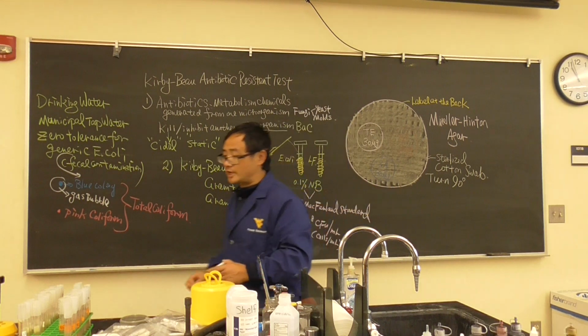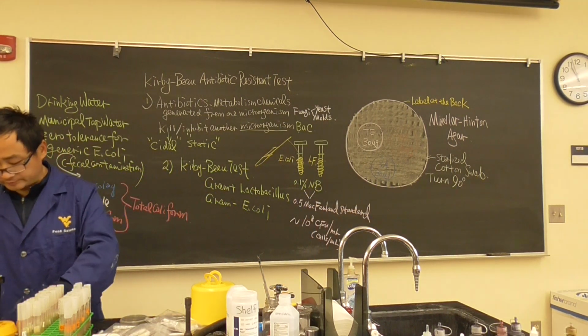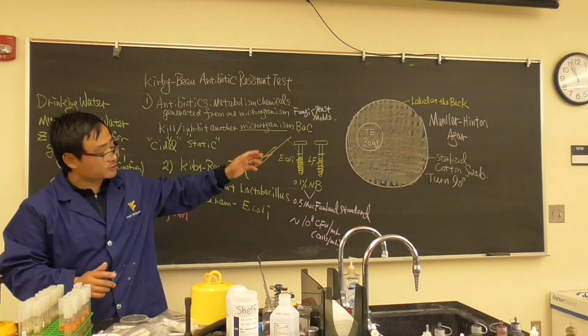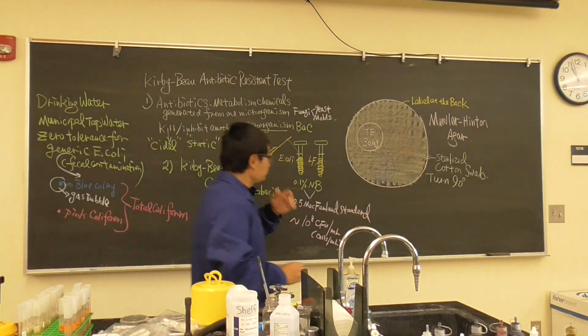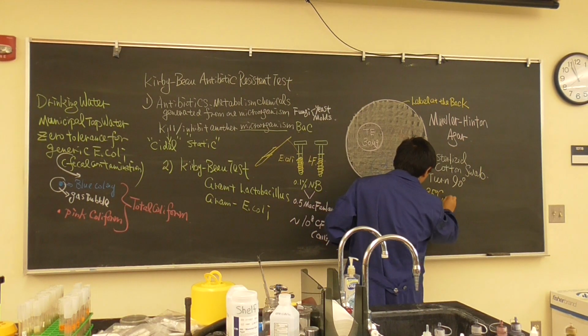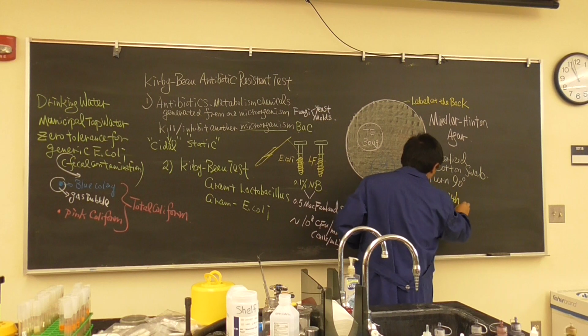Okay, after we use the dispenser, we add a disc onto the plates. We will do 35 degrees Celsius, 24-hour incubation.